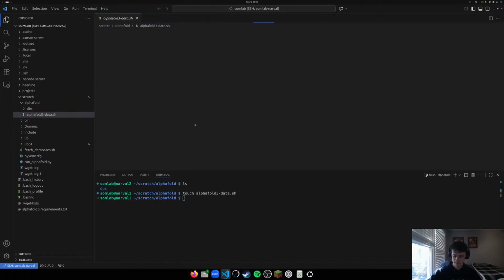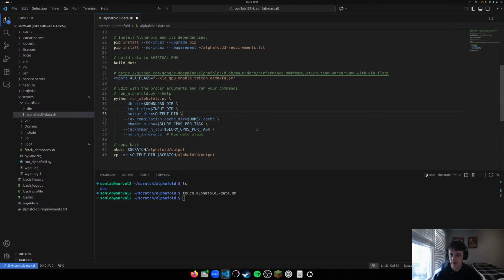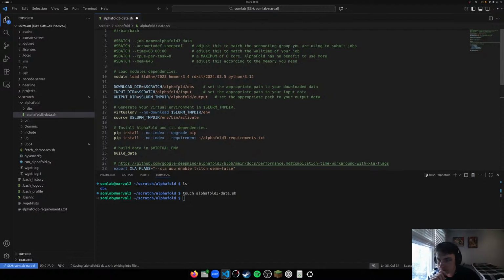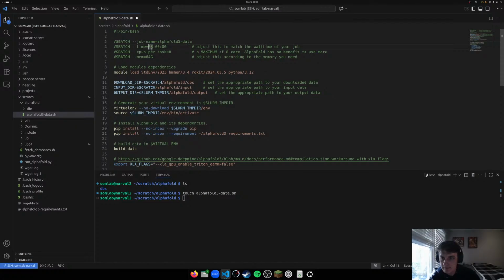Why is it taking so long? All right. So we don't need that. We don't want all of that. Just want like 10 minutes maybe.